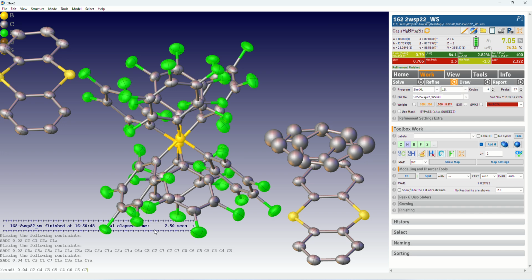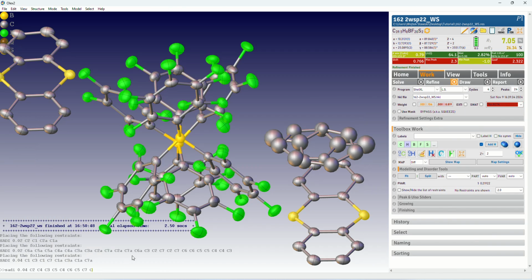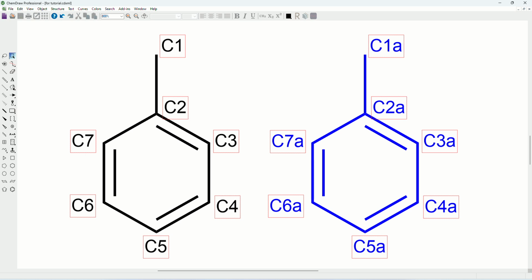And now, the second component. Or, I think I also forgot about C7, C3. Also, I forgot about C6, C2. Okay, C6, C2, and C7. I don't have a great memory, so C7 to C3.